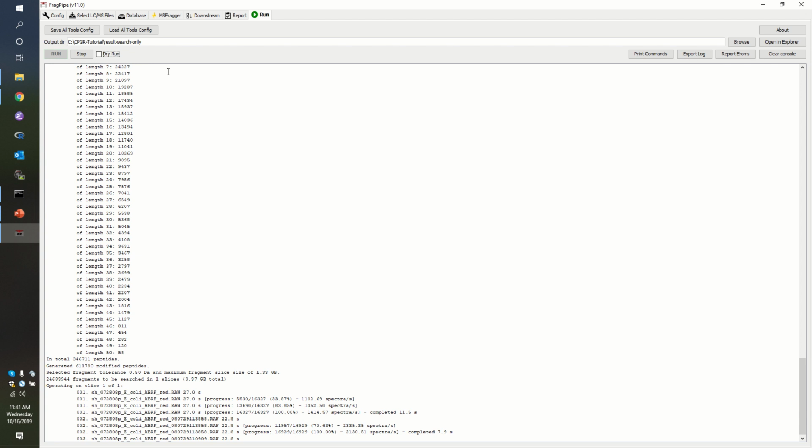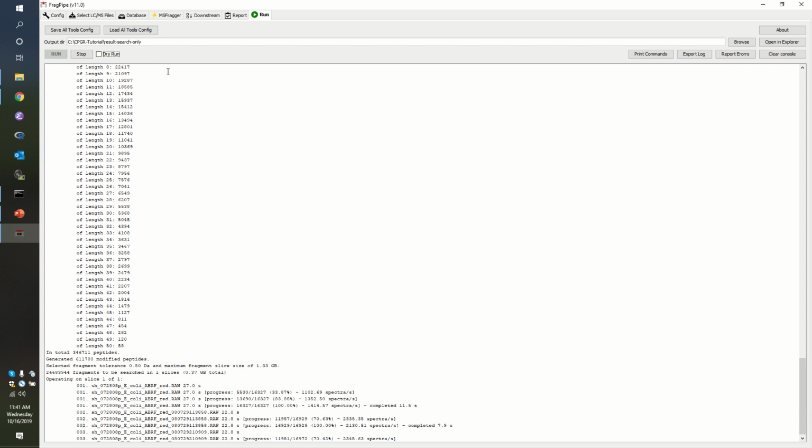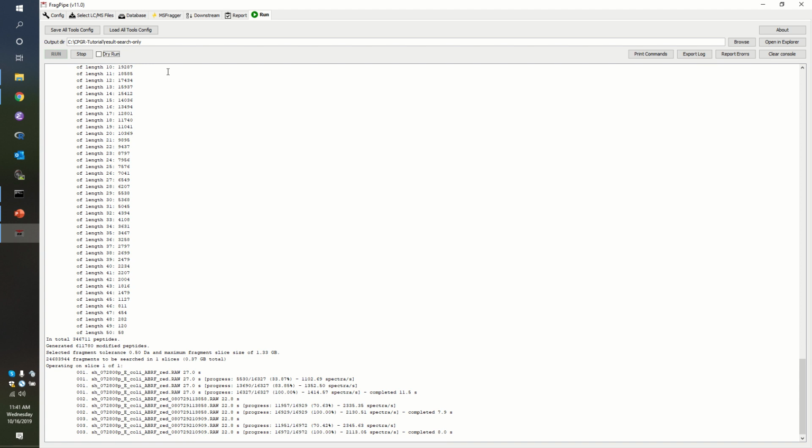Ooh. Okay. You may be using a 32-bit Java virtual machine. Even if you have more than 4 gigs of RAM on your laptop, if you run with a 32-bit virtual machine, it can't see more than 4 gigs of RAM. So that could be the problem.